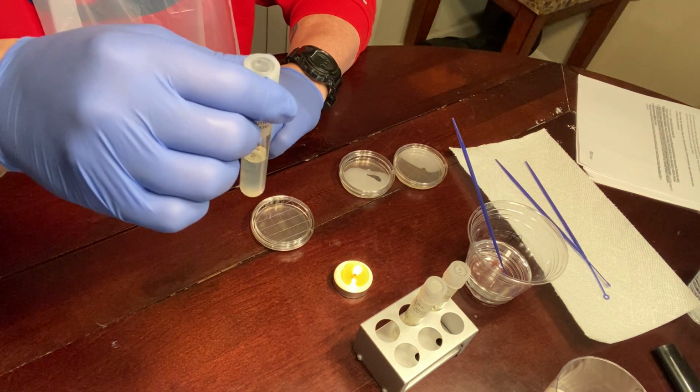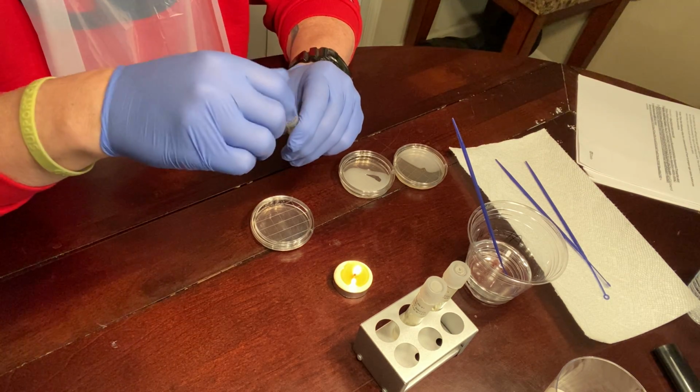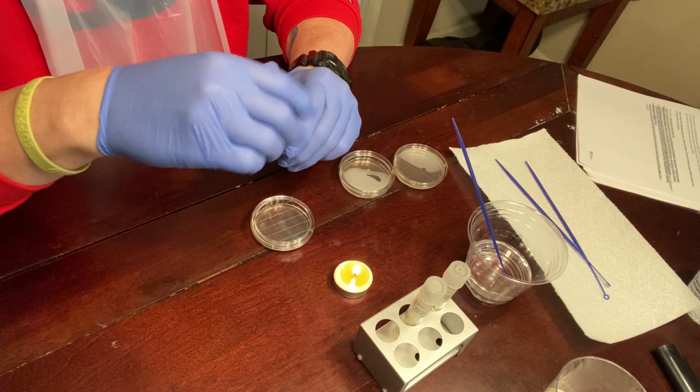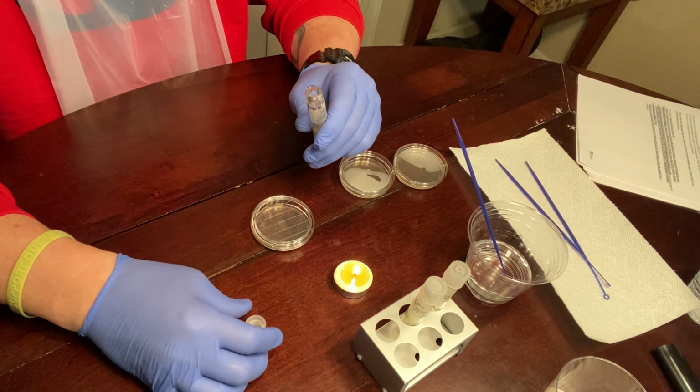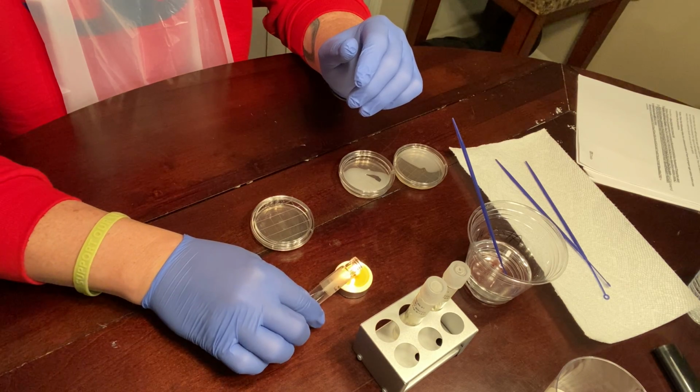And this is the S. epidermidis. And I'm going to repeat the process for this one. Sterilize the rim.